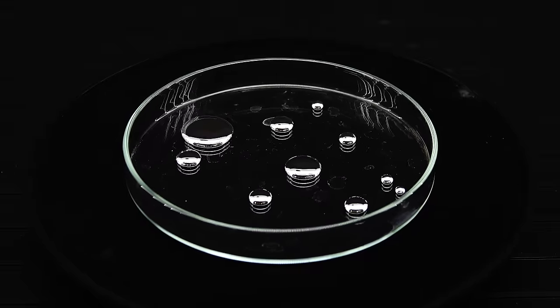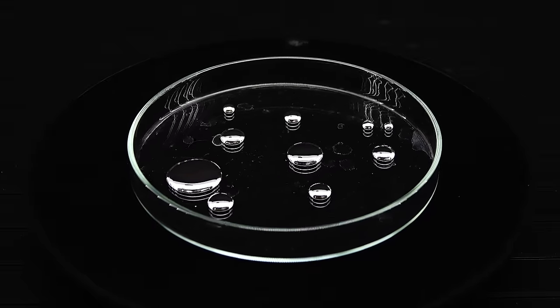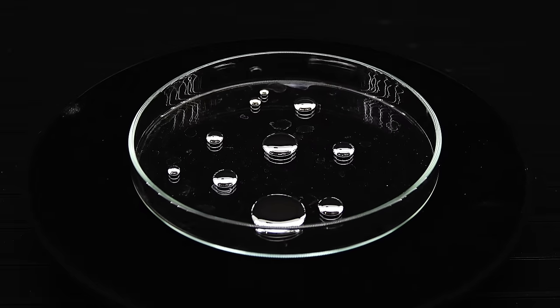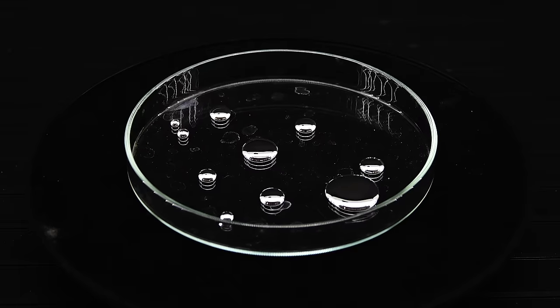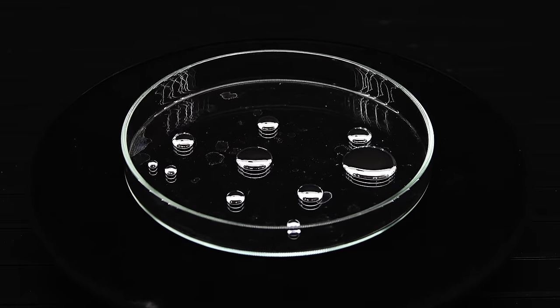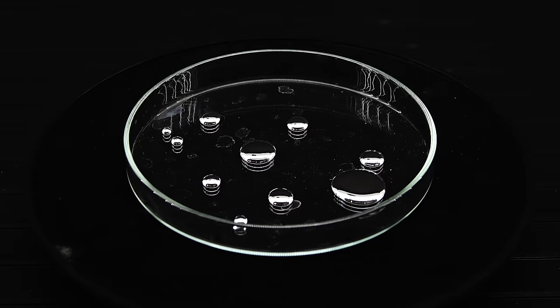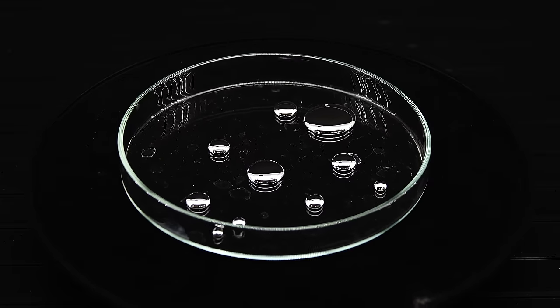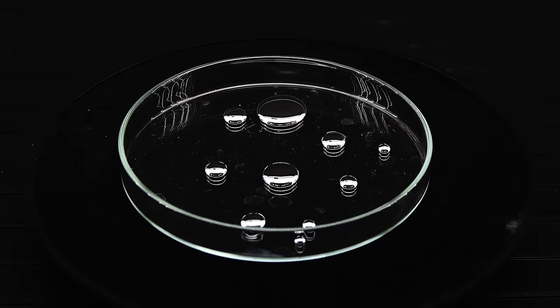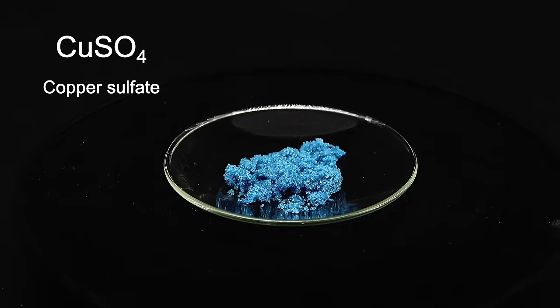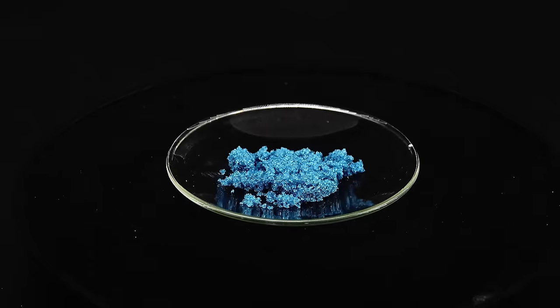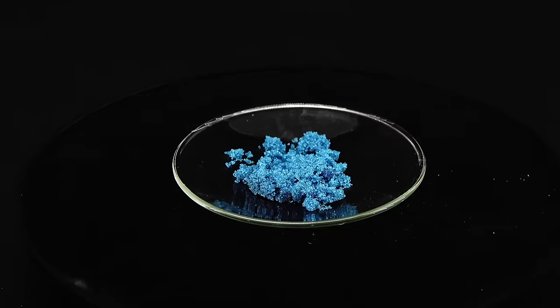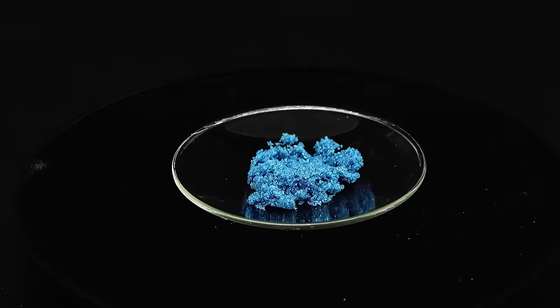With physical grinding out of the question, there are still a few ways to get copper powder with a tiny grain size. The most obvious one is just to buy it, but such powders tend to be quite expensive, and after all, this is amateur chemistry and not amateur shopping. Other methods to make the powder fit much nicer into the scope of this channel, and involve some interesting chemical reactions that take the copper in the form of a salt like copper sulfate and precipitate it out as a metal. This precipitation often results in the formation of some nice powders or sponges that would be ideal for this project, and there are two main chemical methods for making the powder.